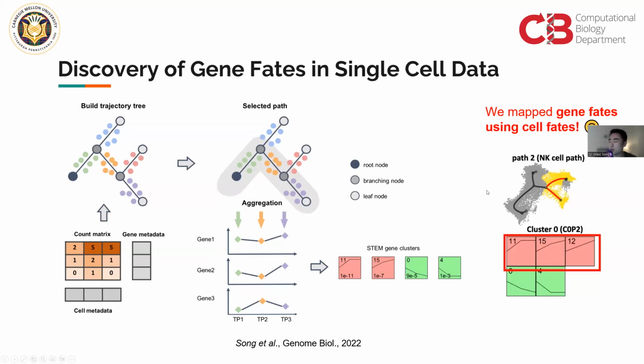I'm showing you one example here, which is the output from our clustering framework. On the top, these are the cells from the natural killer cell set. We cluster the genes based on the trajectory information extracted from natural killer cells, and the end results can be visualized. You can see there are red clusters and green clusters, which show the activated genes and the suppressed genes.